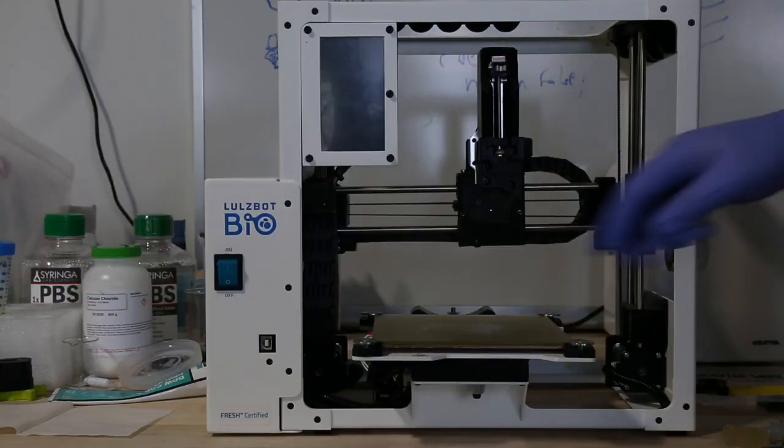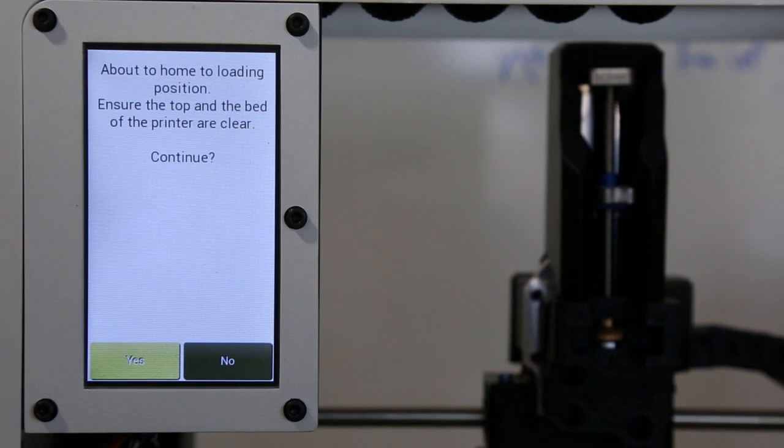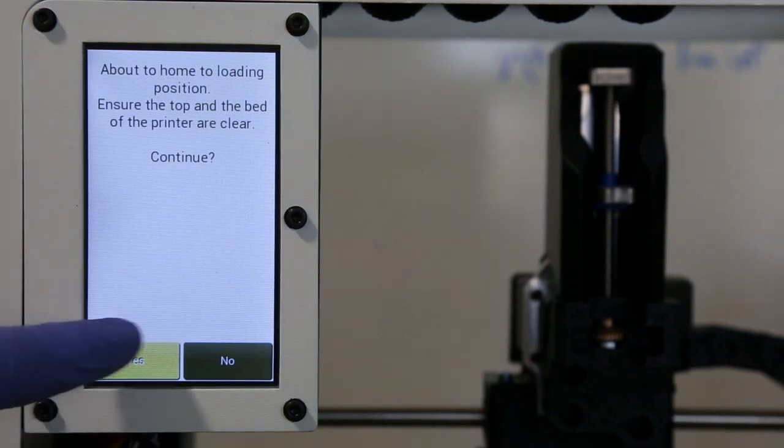So now I'm gonna power on the LulzBot bio. It'll run us through a startup routine. The first thing it's gonna ask is that the bed and on top of the printer is clear. So I'll say yes.